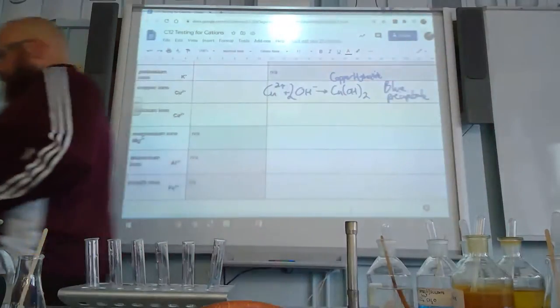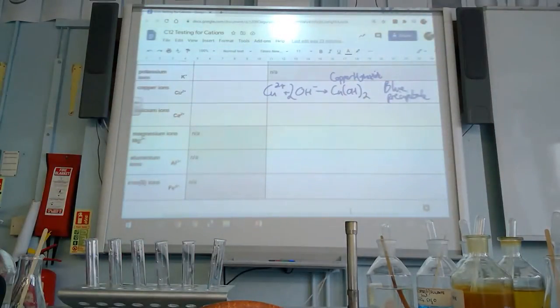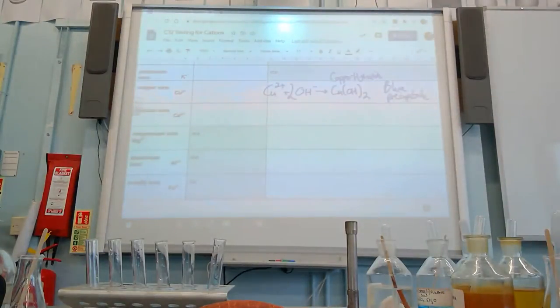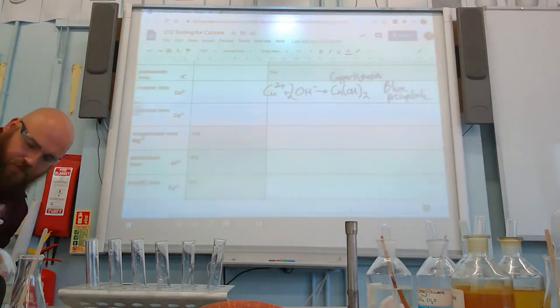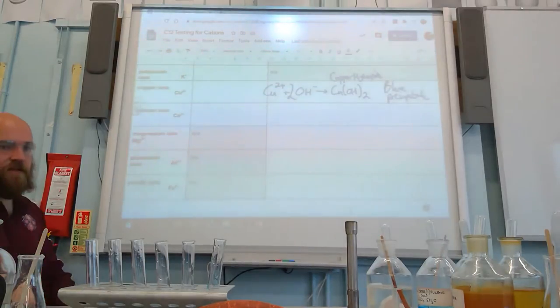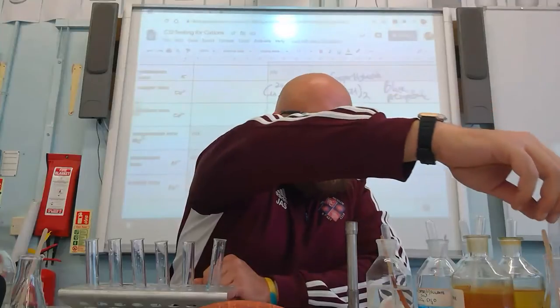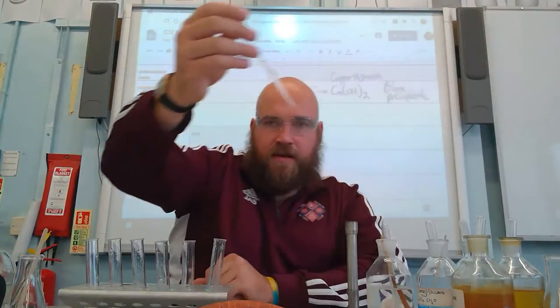Right, so we'll do the rest now, and then we'll fill in the equations at the end. So we're going to look at calcium next. Calcium, magnesium, and aluminium. So let's have a look. So we'll start with calcium. So I'll get some calcium here.